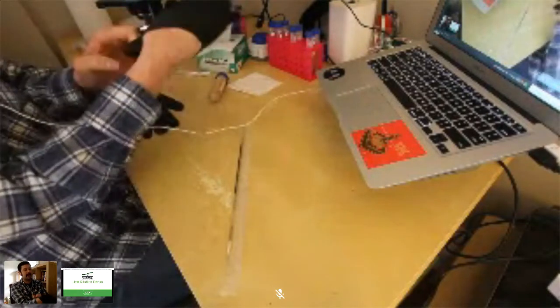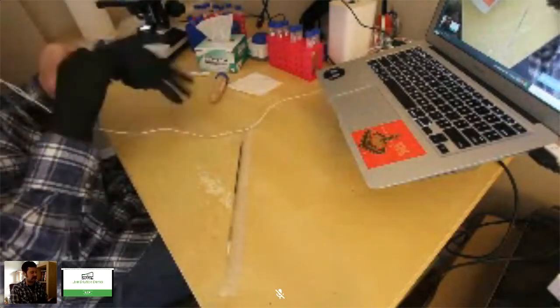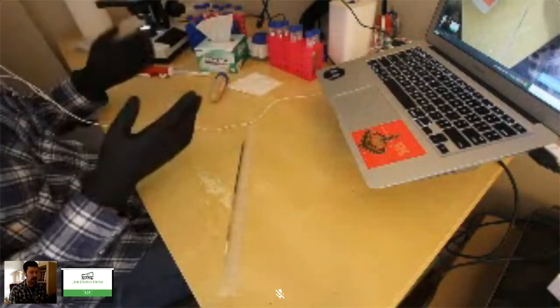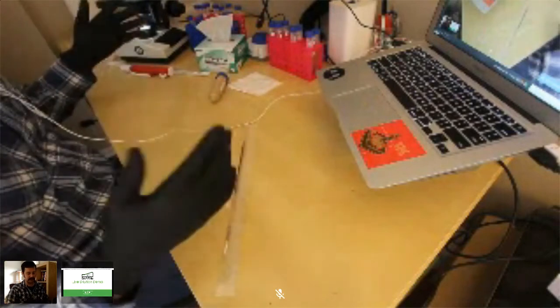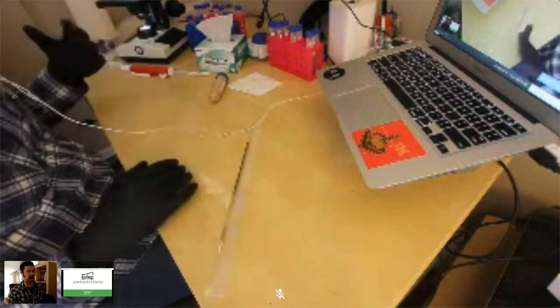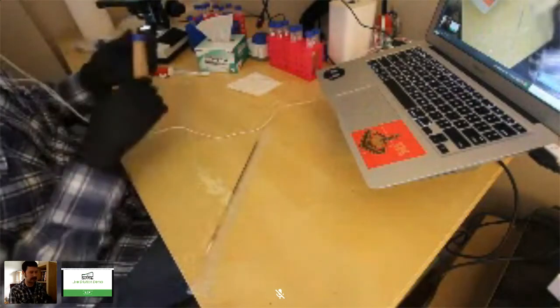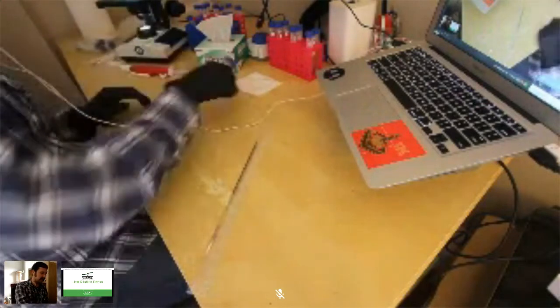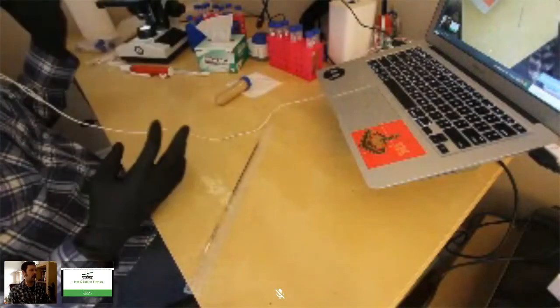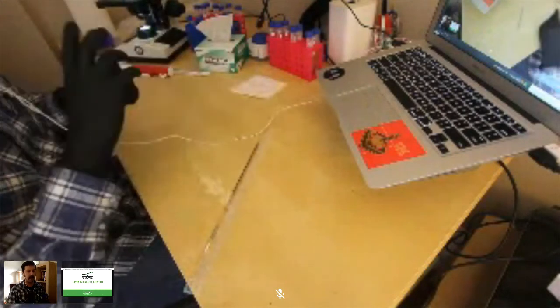Now, the work I'm doing, I'm not using aseptic techniques, so the samples are getting destroyed. If you're going to be working with these samples, let's say you're going to be doing quality work after, what you can do is set up an aseptic environment. So you spray it down with isopropanol, or you can use the Escarpment Labs branded alcohol. It doesn't smell good, but it works. You spray that down, and then you can use an alcohol burner or a Bunsen burner, and you light that, and then you have this aseptic environment where it protects your samples. I'm not working with a protected sample.